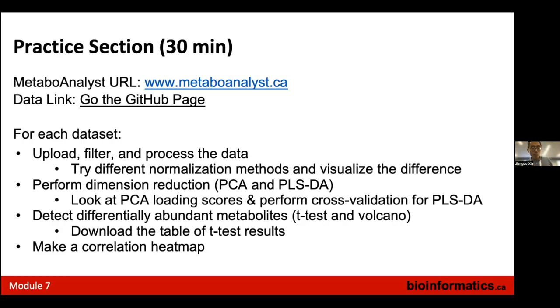From the Montreal side, we noticed that the GC data has a lot of missing values. If you upload and there's a missing value imputation step, click that and use the default to replace with the lowest detection limit — basically one-fifth. After that step you'll be able to visualize your data after normalization. Having a lot of missing values can cause issues for visualization in the normalization step, though it shouldn't change the PCA result.